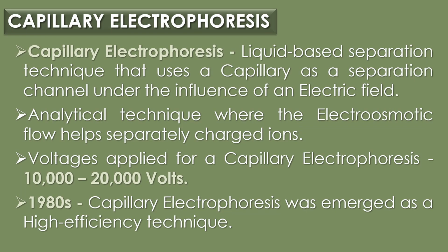Capillary electrophoresis. Capillary electrophoresis is a liquid-based separation technique that uses a capillary as a separation channel under the influence of an electric field. It is an analytical technique where the electroosmotic flow helps separate charged ions. The voltage applied for the capillary electrophoresis experiment is quite large, often 10,000 volts to 20,000 volts.